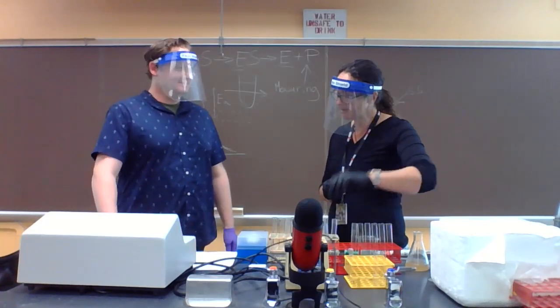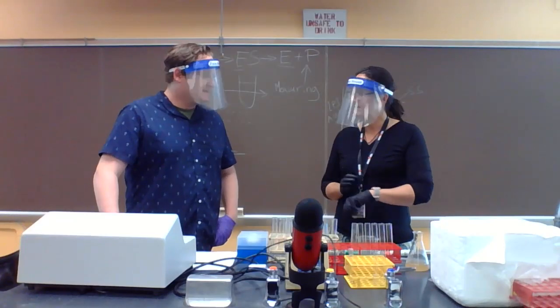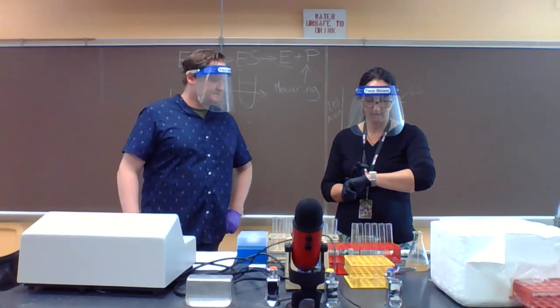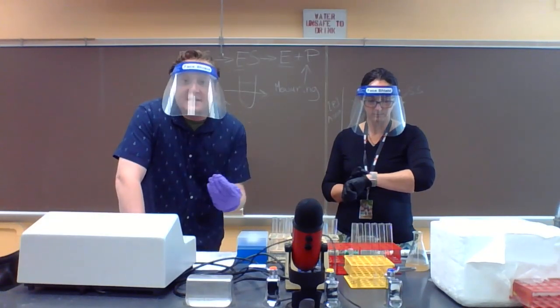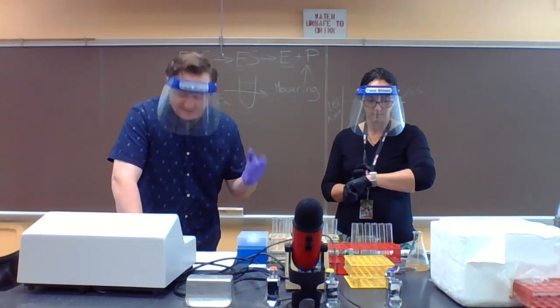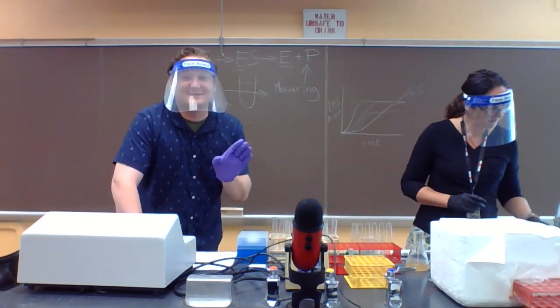Makes sense to me. Okay, so we've got a timer. I have a timer on here. Okay, perfect. So in other words, every minute we will add catechol to a new tube. Actually, there's no catechol in the first tube, but we'll be measuring that at time point 0.